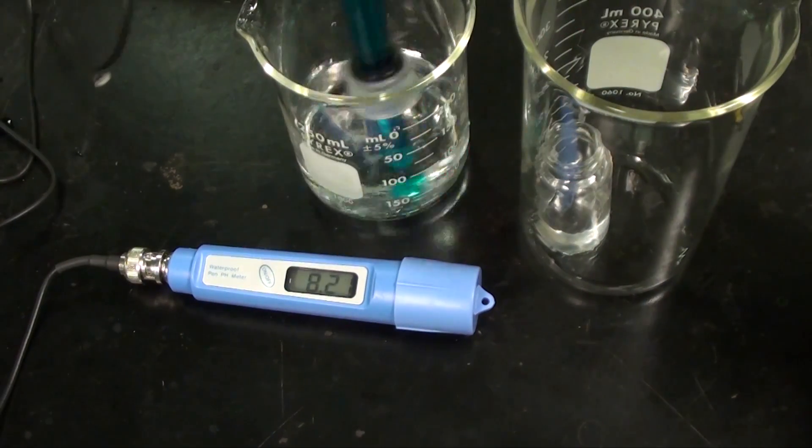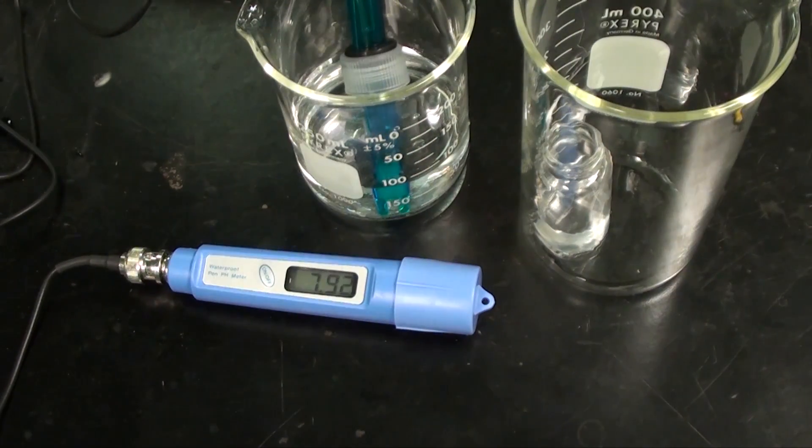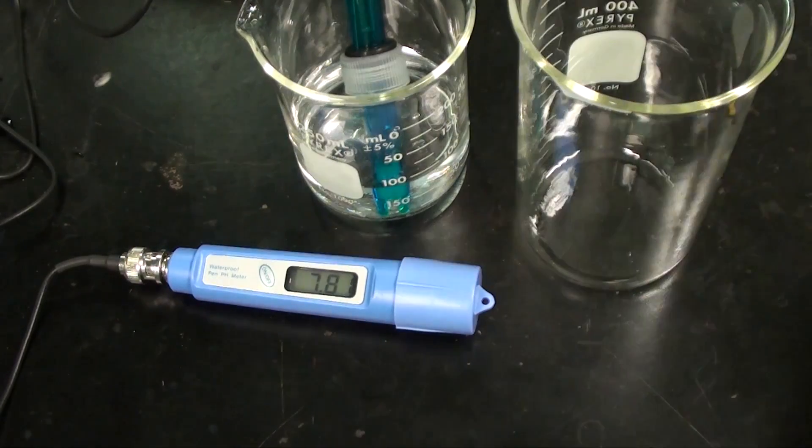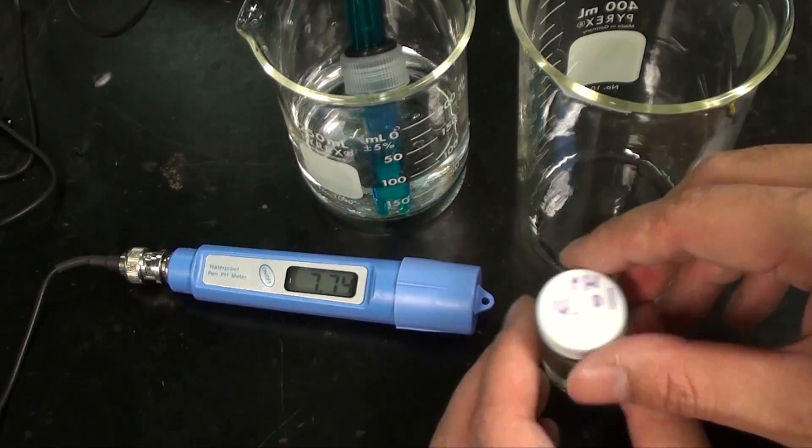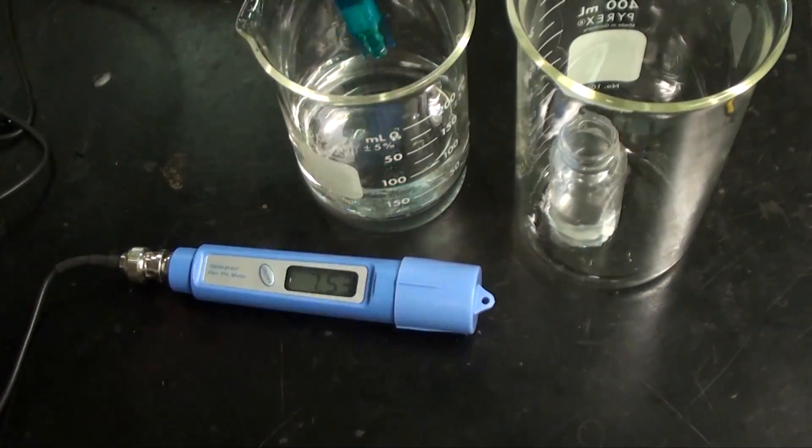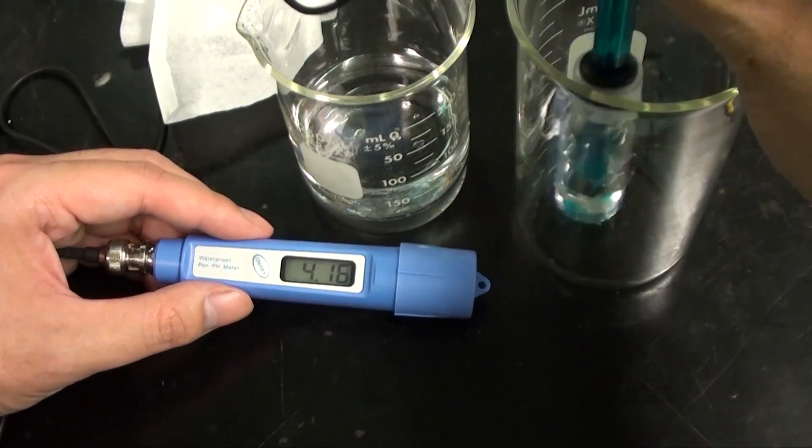What about other points? Let me get a different pH calibration solution and see if the measurement is correct. This solution has a pH of 4.01. As you can see here the pH meter says it's off.